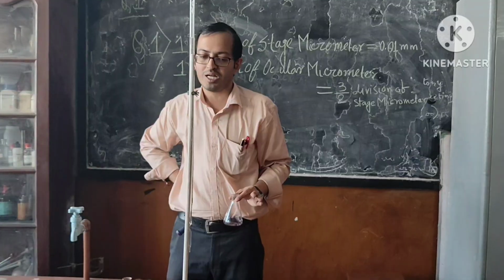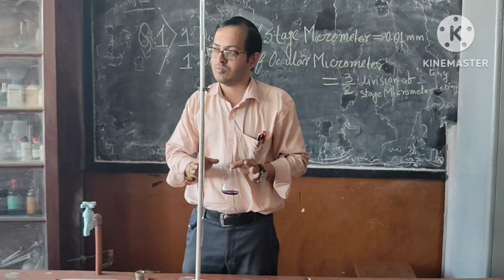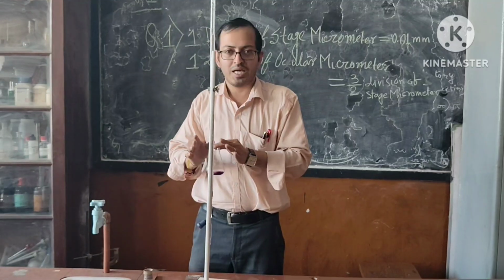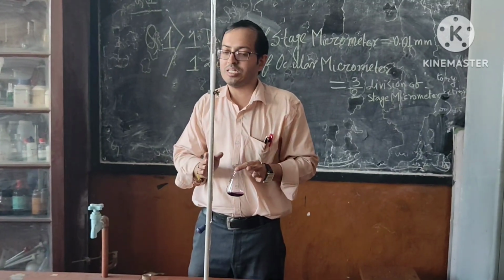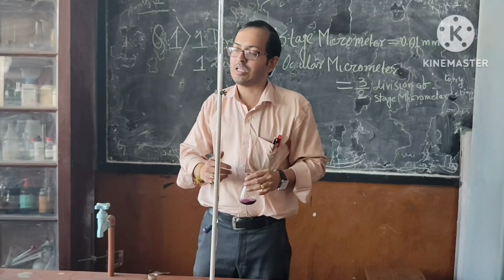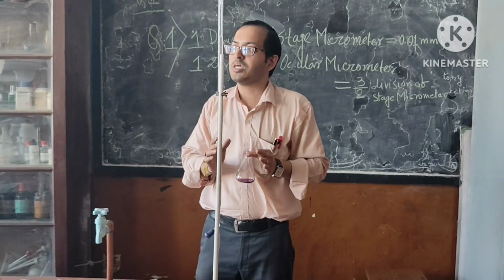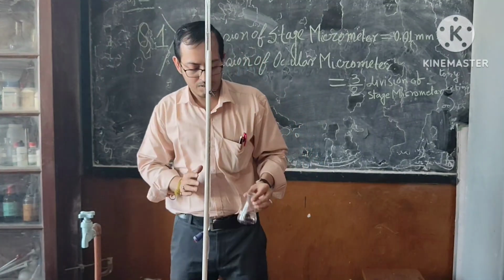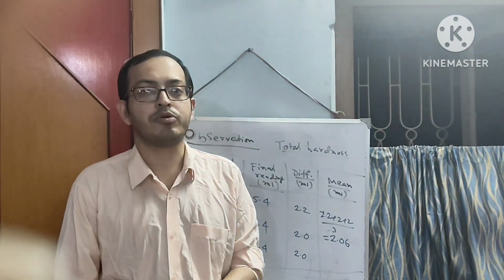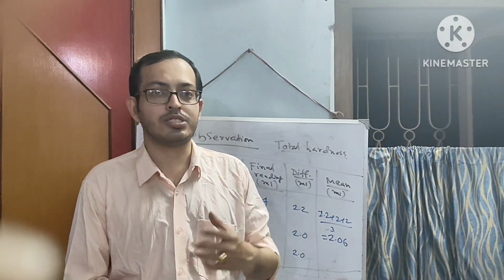ওকে, তো এবার আমরা আস্তে আস্তে ক্যালকুলেশনের দিকে এগোবো, কিন্তু তার আগে ঠিক এরকম ভাবে আরো দুখানা রিডিং নেওয়া হবে। হার্ডনেসের দুটো, ক্যালসিয়ামের দুটো দিয়ে, তাহলে তিনটে করে রিডিং যখন হয়ে যাবে তখন সেটাকে আমরা অ্যাভারেজ করবো, তারপর ফর্মুলাতে ফেলে ক্যালকুলেশনটা করবো। তার ভিত্তিতে যত অ্যামাউন্ট আসবে তারপর আমরা কনক্লুশন বা ইনফরমেশন আনবো। Actually, we have done. So now we have to calculate our findings, okay, and we have to estimate the value.